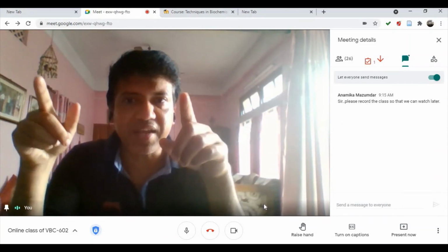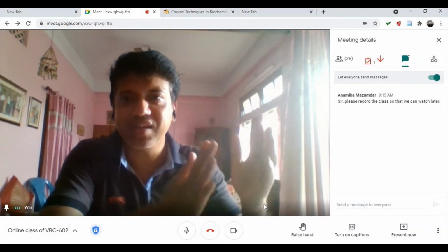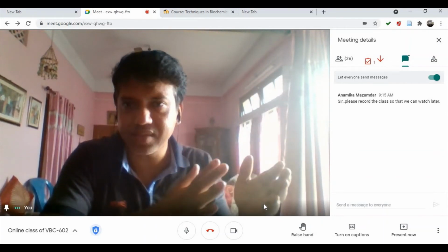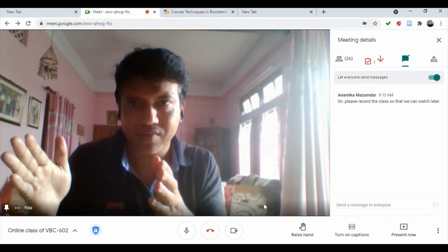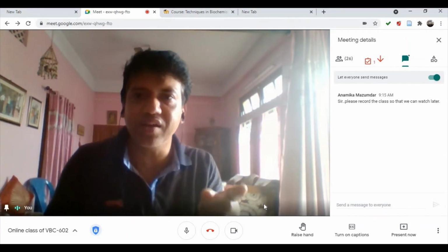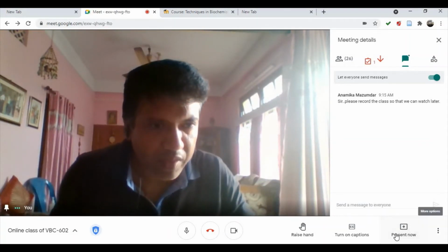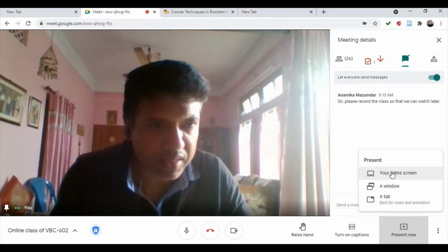The reason is that here the radius is smaller, so the velocity will be less. Here the velocity will be more. But they think, I'm putting the same speed, so no problem. But the problem is there, so we will discuss it.